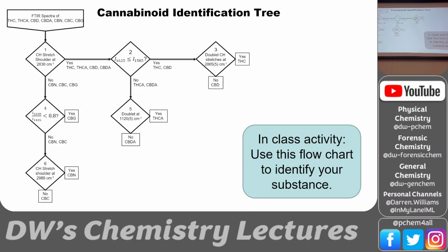So the shoulder at 2830, it's very specific. Okay, the 2830, right here. That's it. But then where is this coming from? Because all my intensities are on the decimal point. I'm not sure what this means.